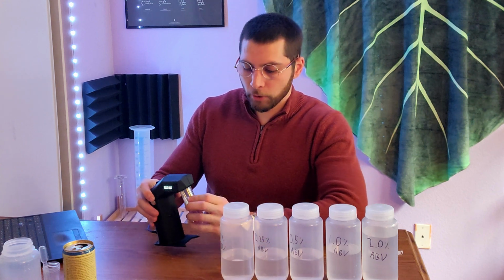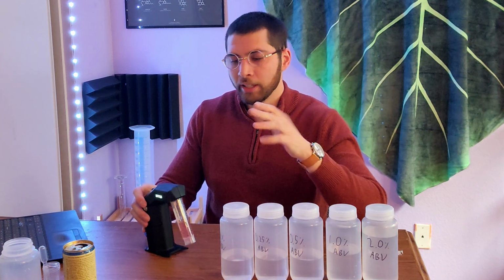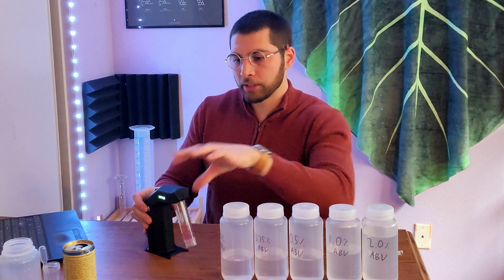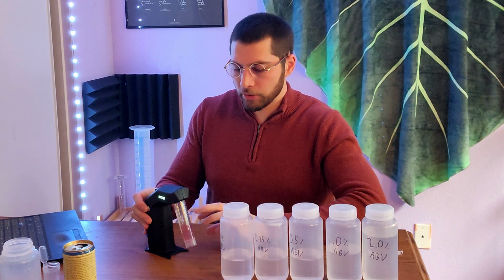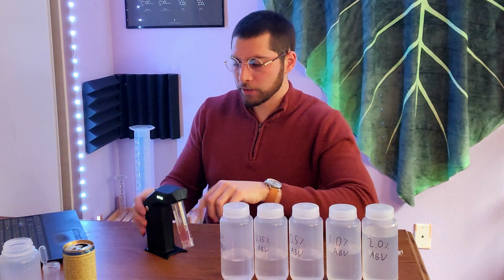And this prevents foaming. So especially if your product is very heavily carbonated, I would just shake it around a little bit. You don't need to do a fancy degas procedure or anything like that. But just shake it around a little bit to get some carbonation out. This product is not super carbonated, so it should be okay. And so that oil will prevent any proteins from making sticky emulsions and bubbling up into the machine, which could damage the device.